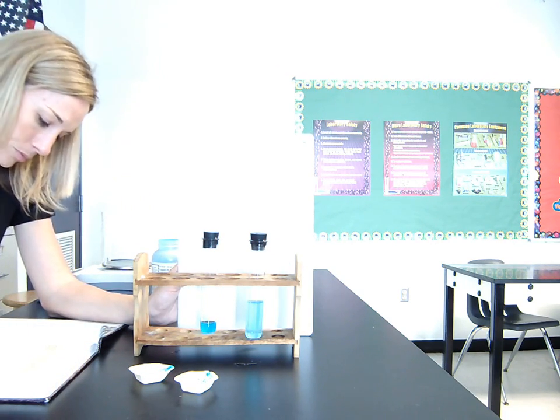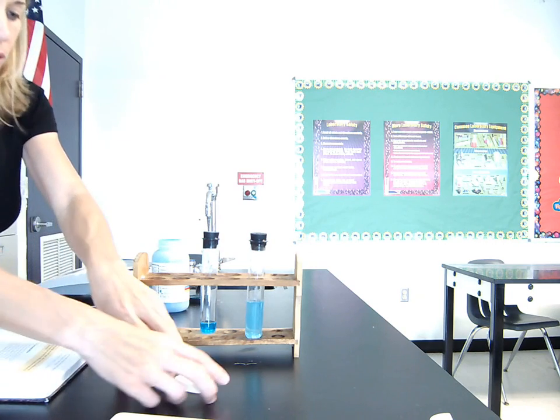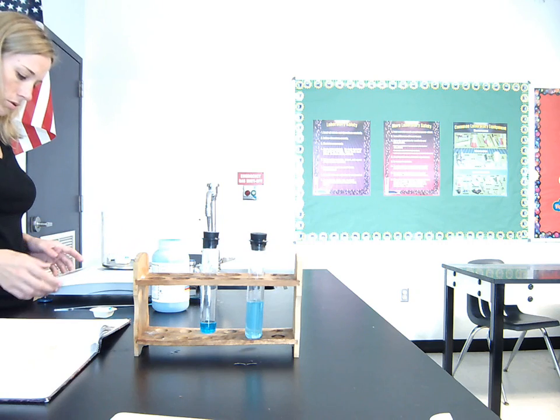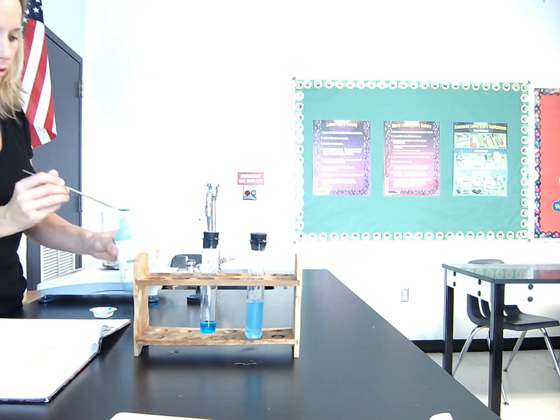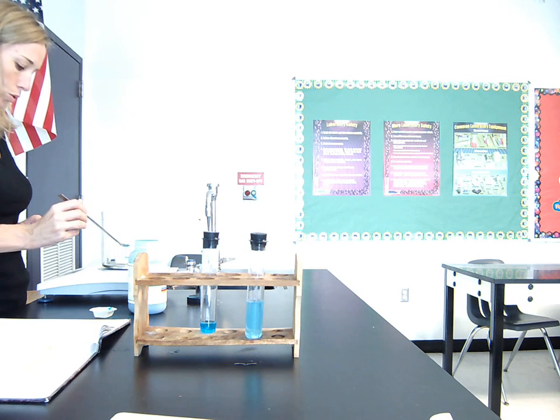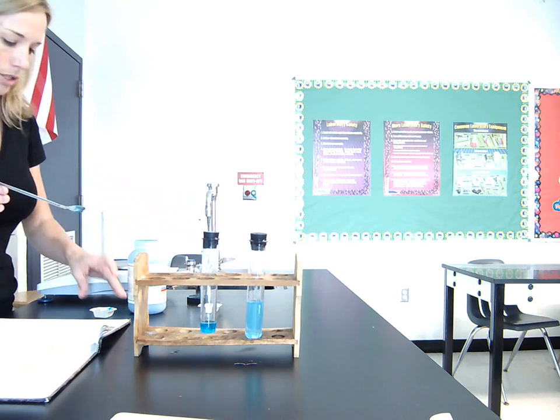Okay, the next part is for us to add another 0.15 grams to each of the test tubes. So let's measure out some blue stuff and see what happens. Again, we're adding the same amount for both of the test tubes. So now we're going to be up to a total of 0.3 grams. So I already added 0.15, and I'm going to add 0.15 again for a second time.